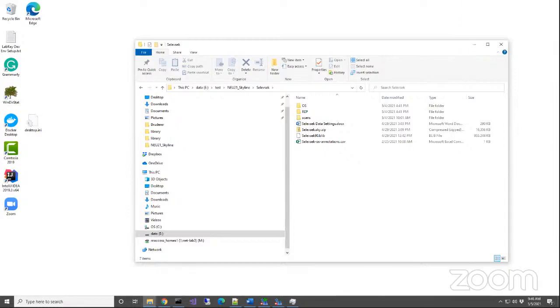Another, for the Waters instruments, it's implemented that you can do the lock mass correction. For Bruker instruments, I remember there's a very specific way, but it requires them to acquire a calibration scan before every LC-MS run to do post-acquisition recalibration. I'm not sure how a SCIEX instrument would deal with this, if possible at all, like the data from this tutorial.